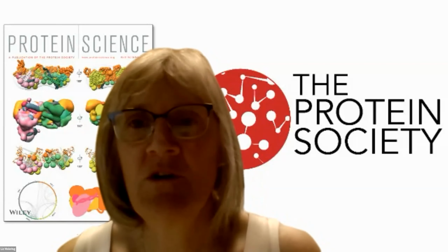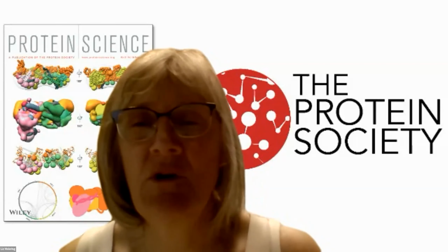Yes. Mm-hmm. So I think, yeah, it's a tough problem. So, Grigory Mishetin, I'm sorry if I'm mispronouncing, how do you determine desired Z coordinate of slicing by ion beam based on fluorescence microscopy? So technical.